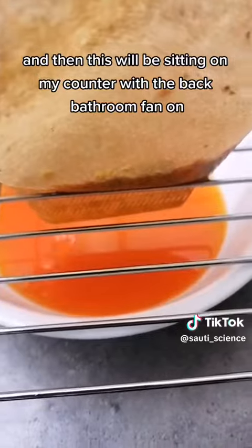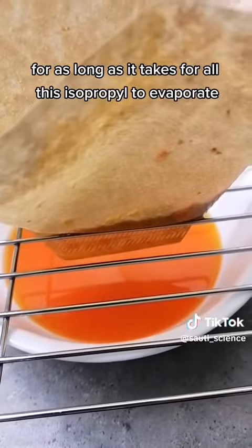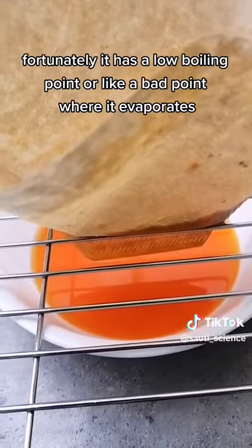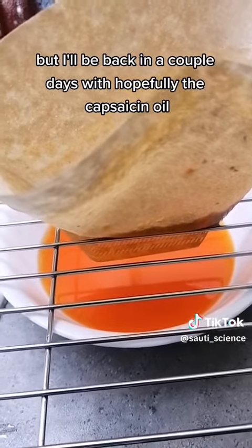This will be sitting on my counter with the bathroom fan on for as long as it takes for all this isopropyl to evaporate. Fortunately it has a low boiling point, so hopefully it shouldn't take that long — I'll be back in a couple days with hopefully the capsaicin oil.